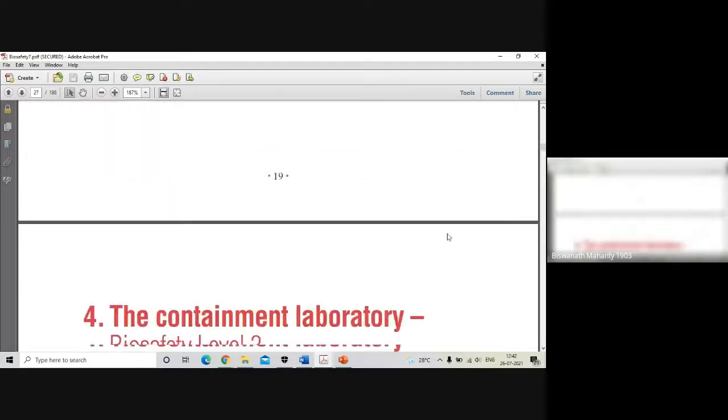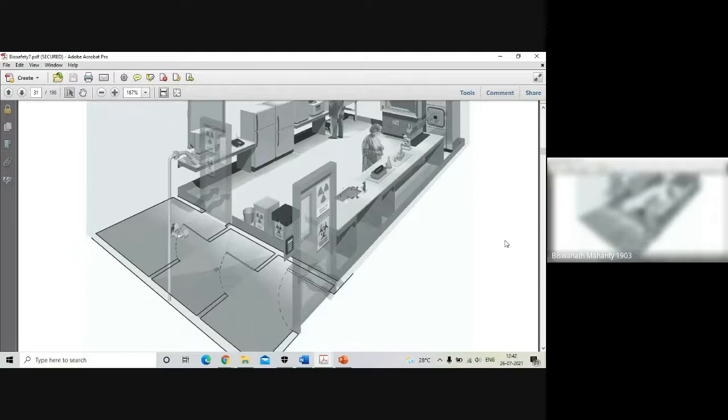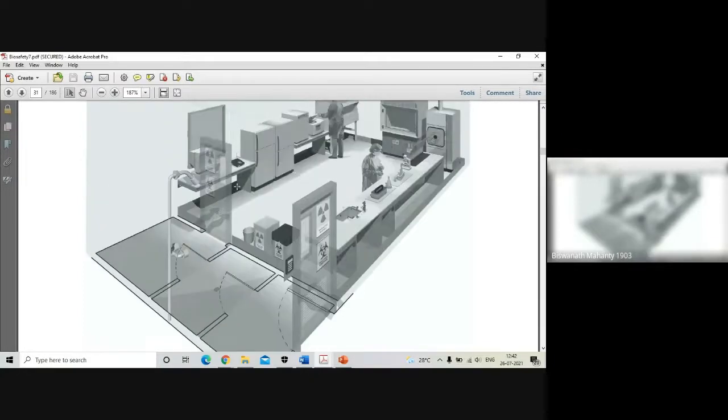But B3, B4 we do not have in our lab system. But in industry, it may definitely be required. Now you see the B3, how much difference? I am having one door here, you see, door plan, one door, common space, another door. My lab is not there. I'm going inside another door and I'm going into the lab. So I have to cross at least 2 doors. In third, I am having the shower itself, attached inside the lab. Shower is already there. Classification of the compounds and hazards are already there.